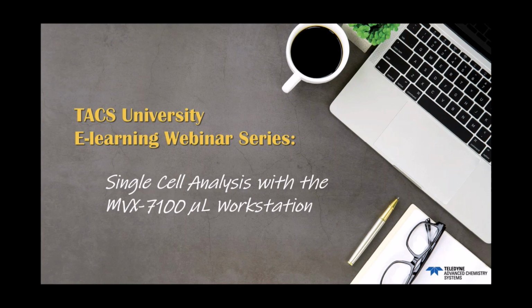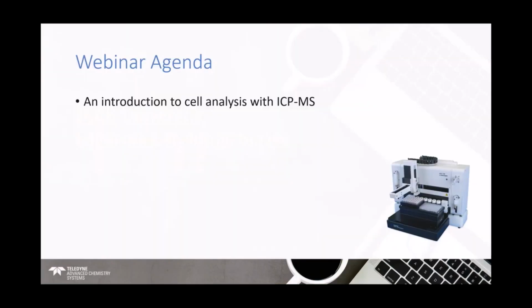I'll start off with a quick agenda, just to go through what I'm going to walk through. I'll give a brief introduction to cell analysis generally, which will take in some of that ICP-MS, and particularly with a focus on cells.